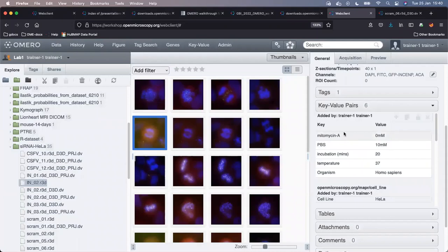If you think about how you construct your notes when you are doing an experiment, you would not write just a single item of information such as anaphase, you would rather write: solvent was methanol, secondary antibody was anti-goat, concentration of secondary antibody was 1 to 1000. Primary antibody was anti-actin or whatever. Temperature was 37.